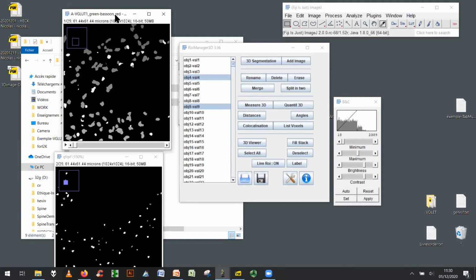Jonas, you wanted to... So my question is, for example, we are working on microtubules or other cytoskeleton proteins, which are filamentous in 3D. How would you do the segmentation there? Because the Gaussian parameters here basically make it elliptical or close to round. Yeah, you're right. Because of our work, we focus more on spots. So most of our plugins and segmentation and analysis is for spot-like objects. So I must admit, we don't really work a lot on filaments.